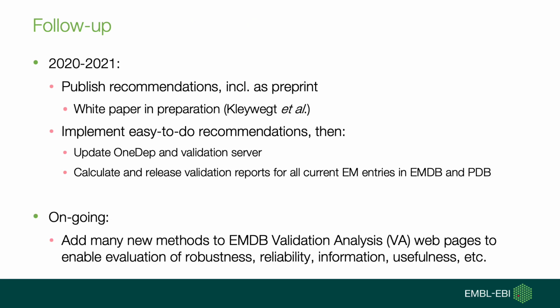So the follow-up for the meeting and the recommendations is that we should of course publish a white paper, so that's in preparation. And we've done a lot of implementation already of the easy-to-do recommendations. They have been added to the OneDep validation pipeline and the validation server.